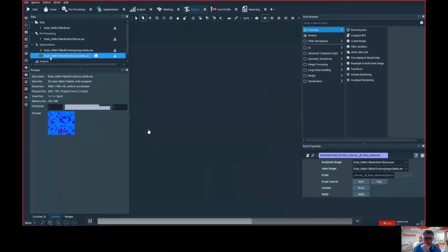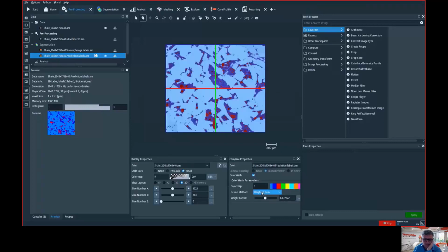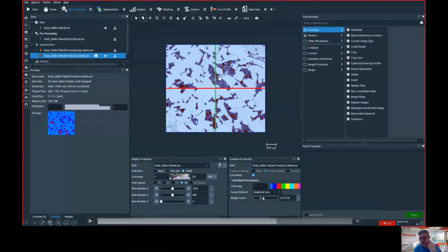So this is just to let you appreciate what you could do with Python. You can really extend Avizo. I know plenty of people that have Avizo and do this outside Avizo. So they say, yeah, Avizo, I use it just for visualization, and then I do my processing with, I don't know, ImageJ, Python outside. And for us, we don't really understand why people don't integrate everything like that, because it's going to be a lot easier for you to work with tools integrated into Avizo.